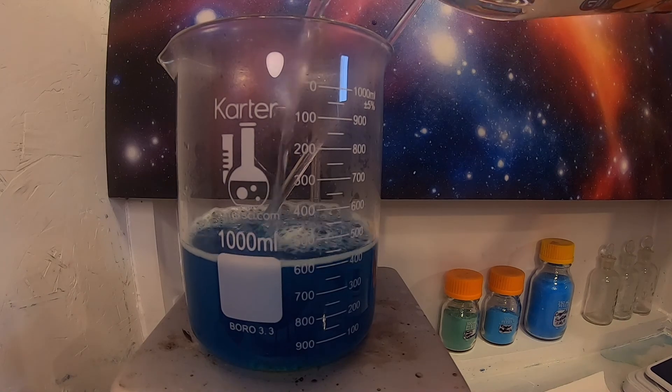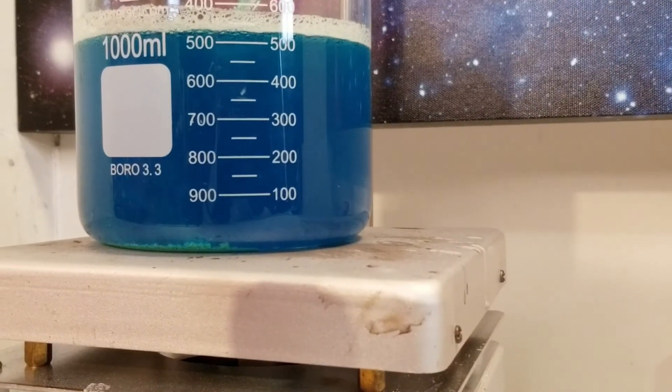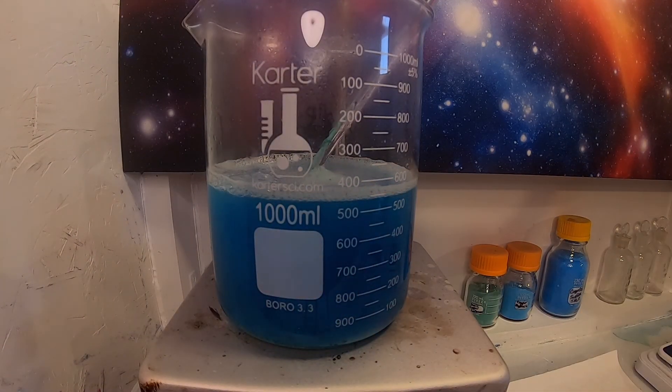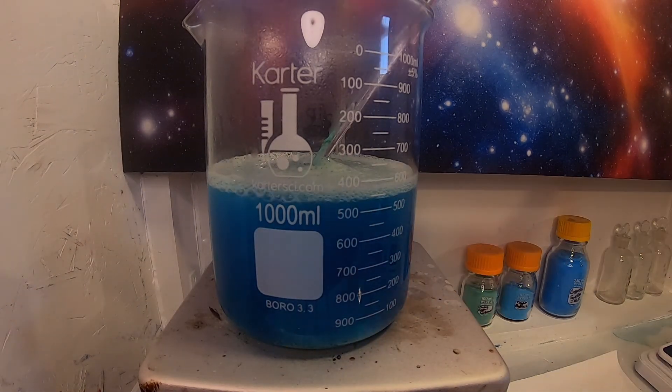I first add some more acetic acid and allow it to warm up. After the solution has warmed, I add some more copper carbonate. You can see more CO2 gas forming, showing more copper acetate is forming.